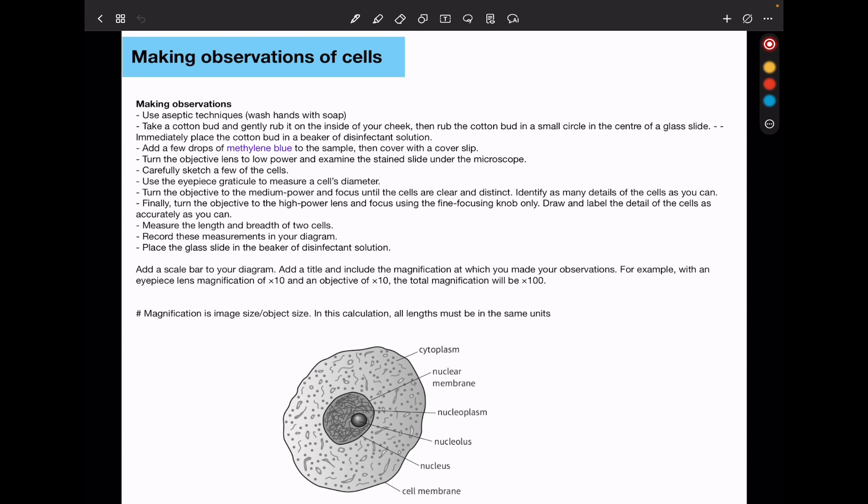So here we have to use the aseptic techniques. We need to wash our hands because sometimes contamination could occur and different cells end up on the microscope slide. In this case, if you're trying to observe your own cells, like cells in your cheeks or cheek cells, you'll get a cotton swab and gently rub it in the inside of your cheek. And then you rub the cotton bud in a small circle in the center of the glass slide. After that, you're going to place the cotton bud in a disinfectant solution because of course, there are microorganisms that could be pathogenic. You will add a few drops of the staining agent, like methylene blue, to the sample and then place the cover slip.